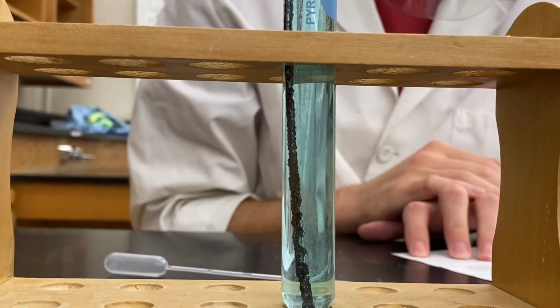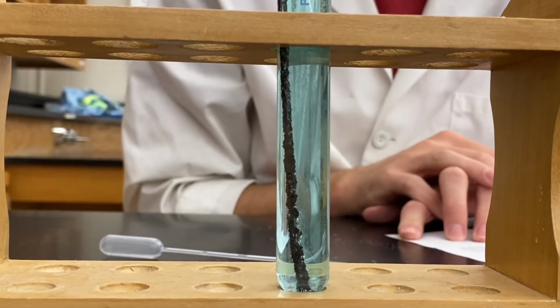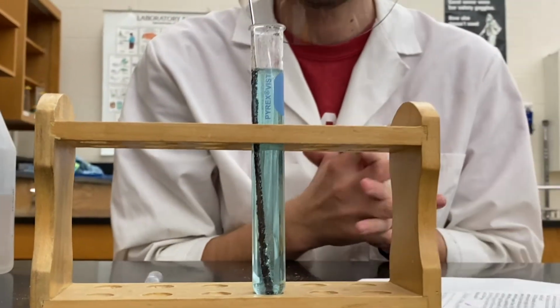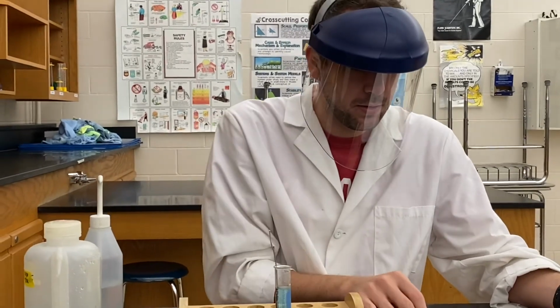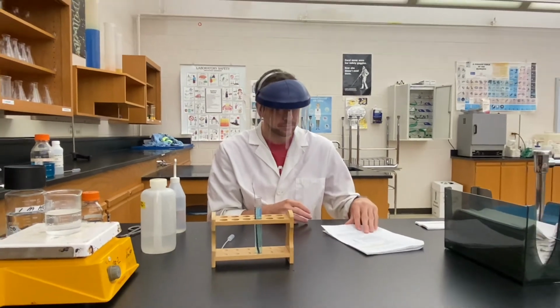And then if I dip that back into our test tube, we also have another reaction happening in our test tube, and that would be the aluminum wire reacting with the leftover hydrochloric acid from the previous step. The products from that reaction would be hydrogen gas, as you can see the bubbles there, and aluminum chloride in the solution.